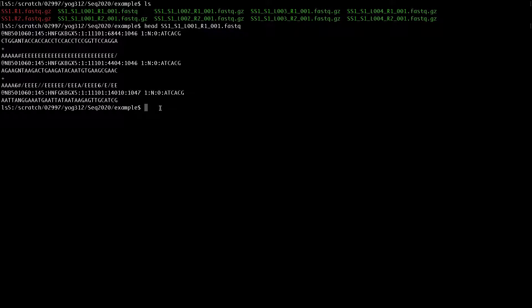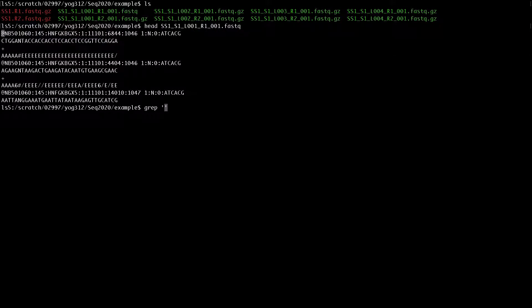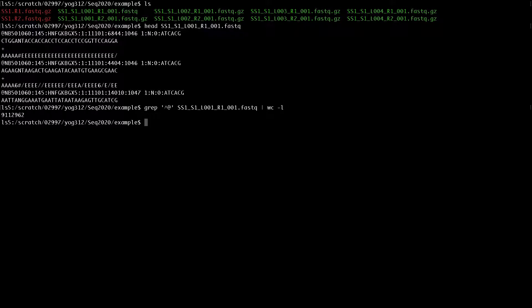If you want to count how many reads you have in your FASTQ files, you can use 'grep'. Since each read has four lines but you only want to count the unique identifier line, you can grep for everything that starts with the '@' sign in your FASTQ file, and then pipe this into 'wc' to count the number of lines. This command is basically saying: in this FASTQ file, count all the lines that start with '@'. When I run it, it quickly generates the result — this particular FASTQ file has 9.1 million reads.